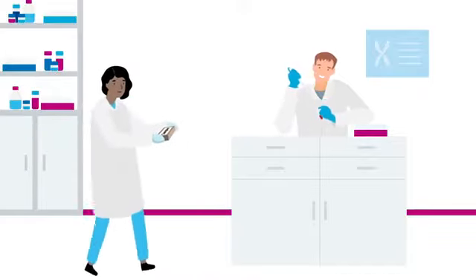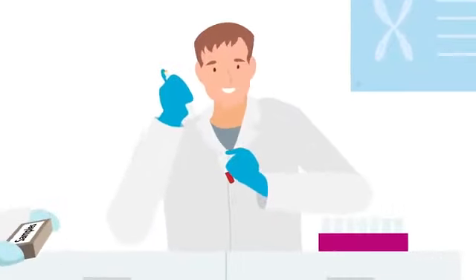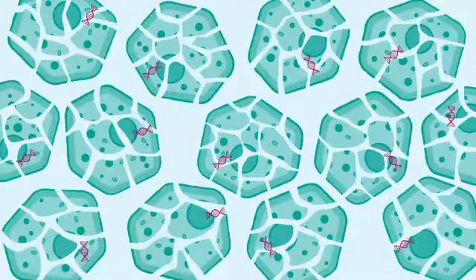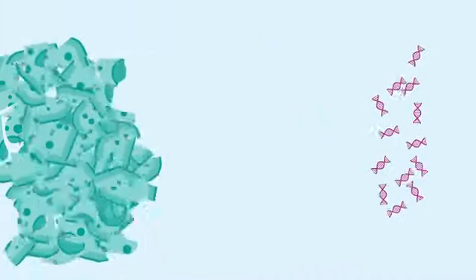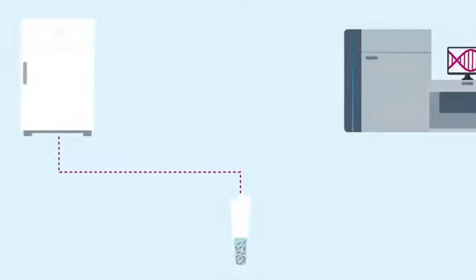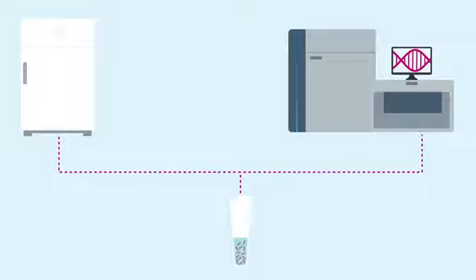When the sample is received by the laboratory, technicians need to extract the DNA in preparation for sequencing. The DNA is released from the cells, purified, suspended in a liquid, and then either stored until needed or prepared for sequencing.